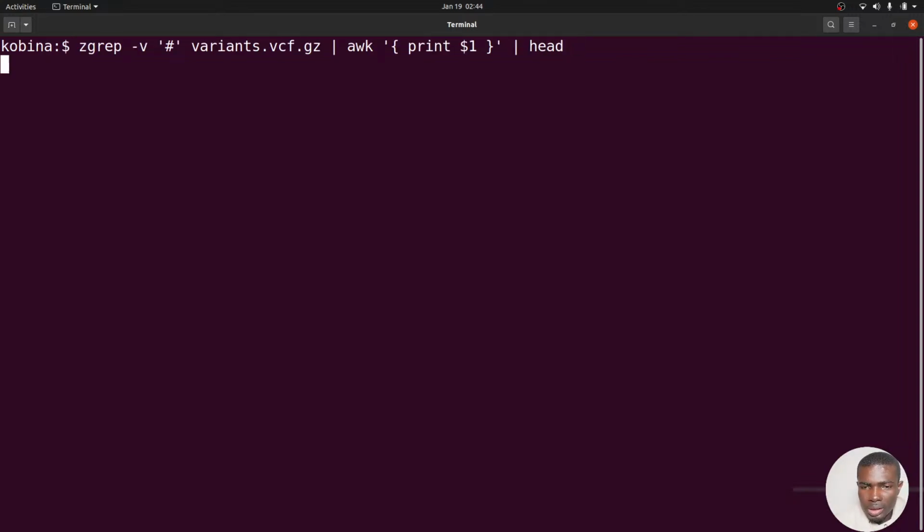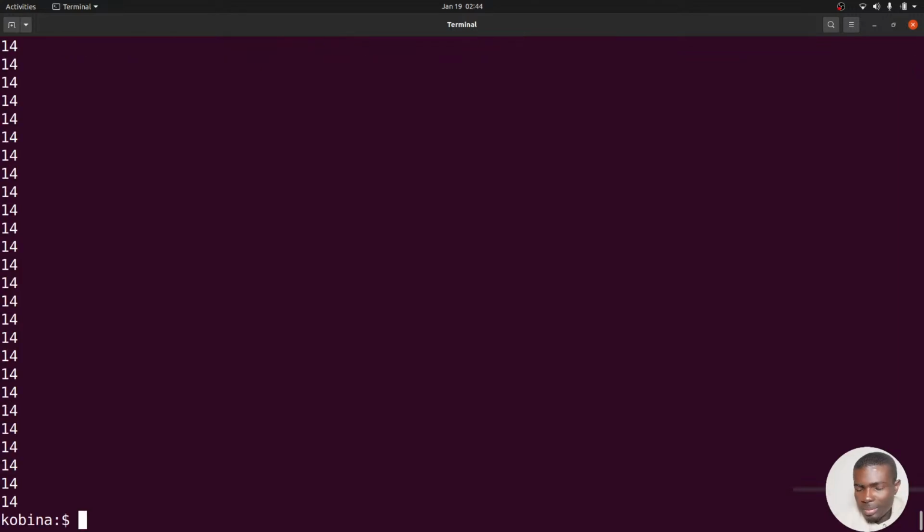This time we just use a head to get, so head will give us just 1. Now what we have here, we are listing all the chromosomes, such as this one here. We are listing all of them, but sometimes we don't want all the chromosomes. We just want a summary, just what chromosomes are present.